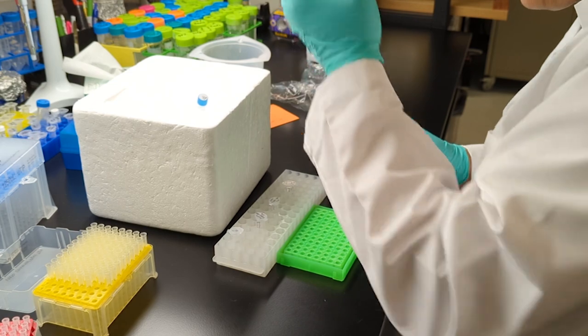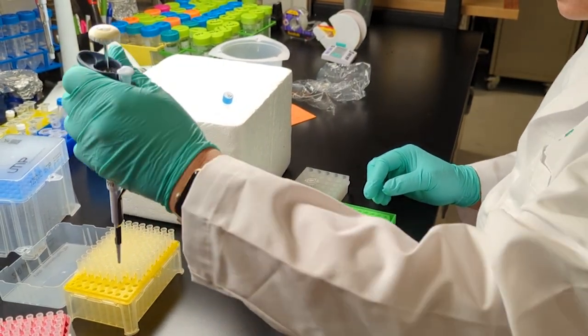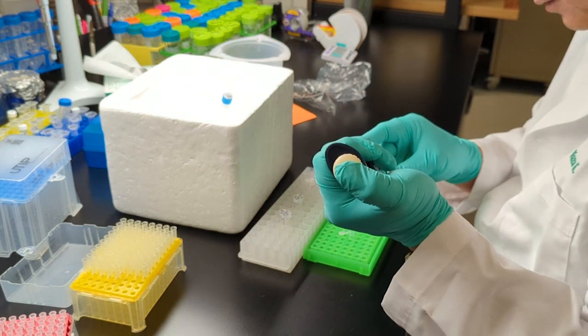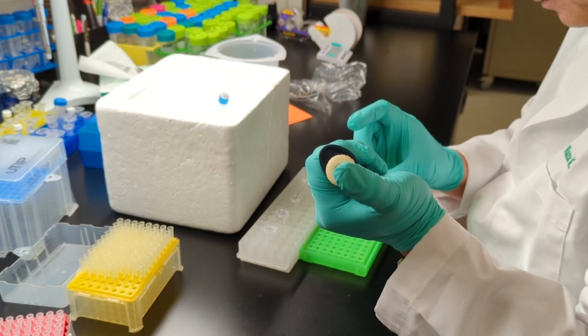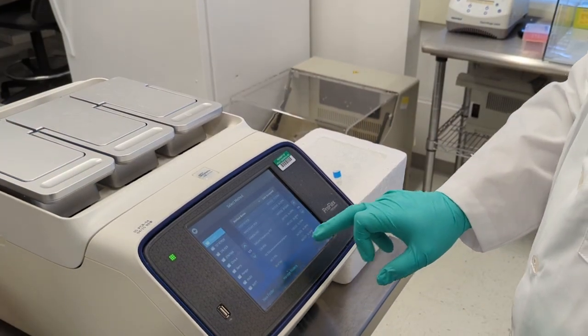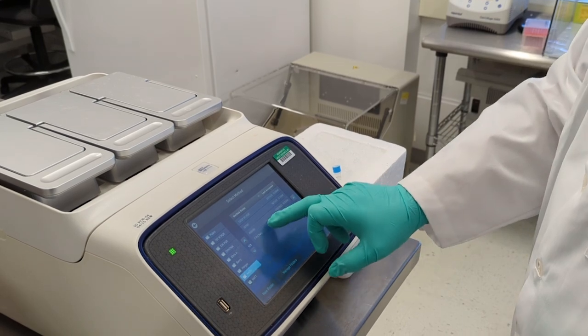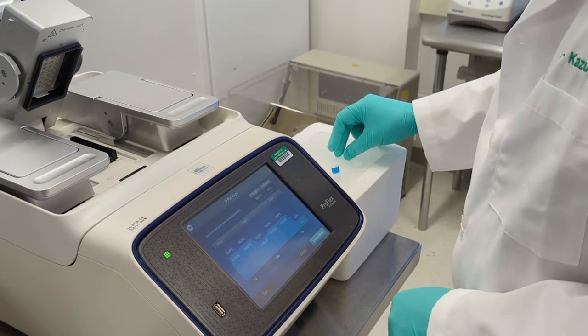Next, you will amplify the DNA of interest with Intact Genomics I7 High Fidelity DNA Polymerase 2X MasterMix, or any other high fidelity DNA polymerase. Program and run the thermal cycler according to the manufacturer's instructions for your chosen high fidelity DNA polymerase.